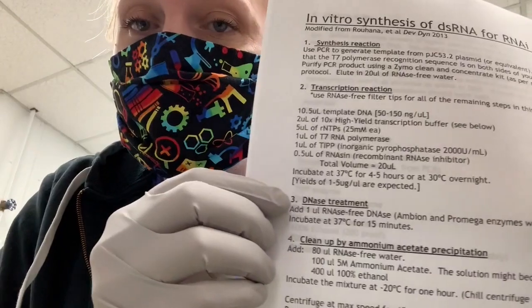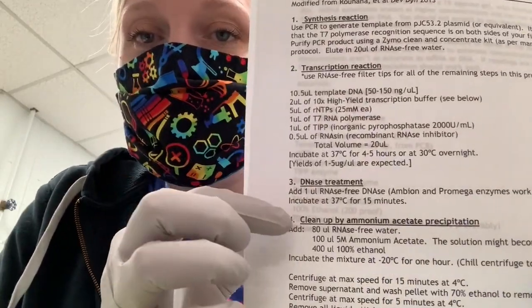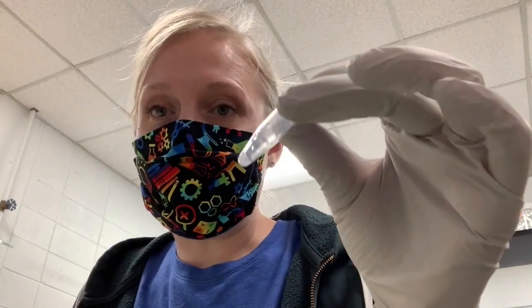So what we're going to do today is to first DNase treat the samples, and this will get rid of the DNA template. And the second thing we're going to do is clean up. So we're going to precipitate the nucleic acid out of this to separate out those enzymes and other molecules that are in our tubes. So the first thing we're going to do is our DNase treatment.